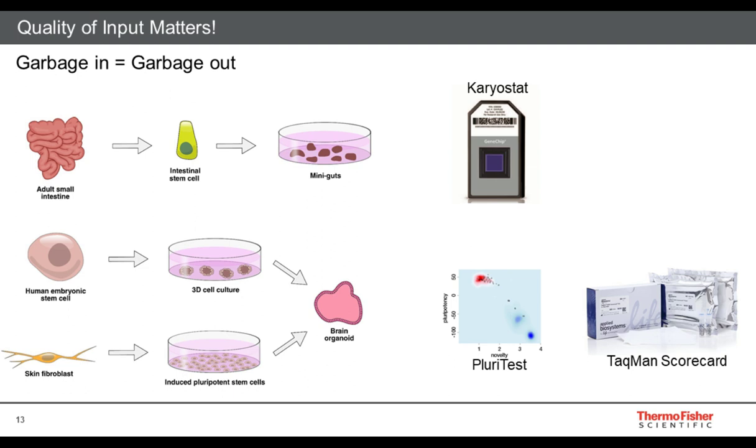And so in view of that, I think it's really good practice to remind oneself to take the time and periodically characterize your cells, make sure that they are of sufficient quality to make it worth the investment to move into a 3D cell culture model, because these do tend to be reagent intensive protocols.